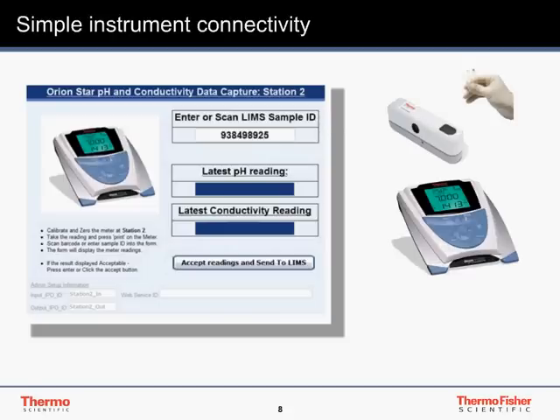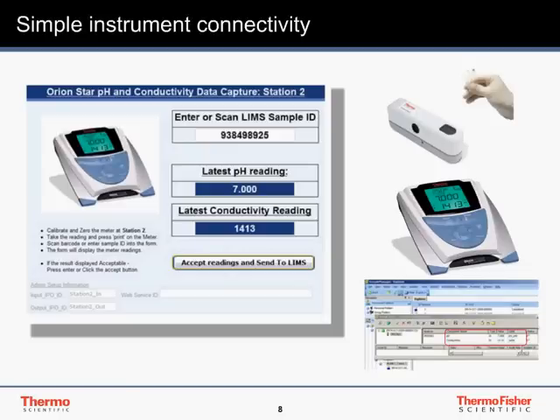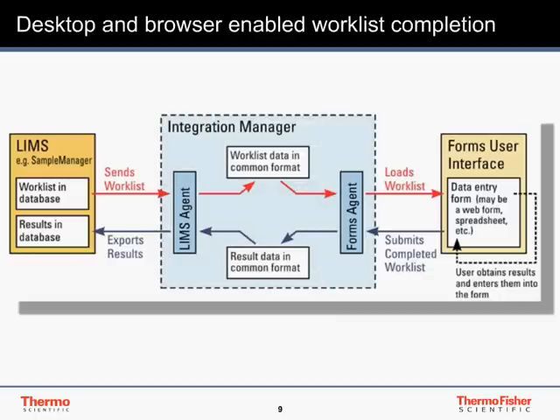As the ID is entered, multiple data items are read from the instrument, which may be connected to a local or remote Comport agent. If the results are acceptable, then the technician can press return and the data is sent to the LIMS. On other occasions, work will be carried out on a batch of samples, requiring bidirectional connection with the LIMS.